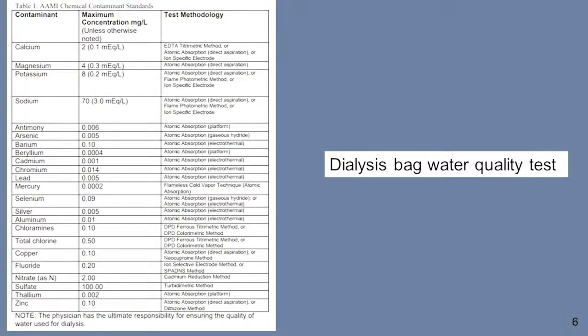Dialysis bag. So one of our collaborators from Medical College of Wisconsin came to our lab and asked, can this sensor be used for dialysis bag evaluation? In that particular case, they are not interested to know how much of each of these compounds they have there. They only want to know it's a yes, no test. That's all it is. Can I use it in the patient or I cannot use it in the patient? The sensor is ready for this.